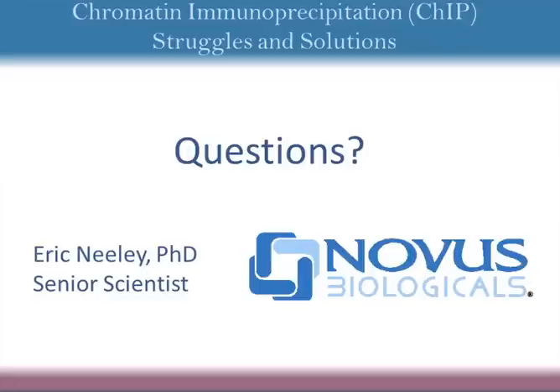So most companies will grade their antibody and call it ChIP grade or ChIP validated. You don't want to use this as a misnomer. You don't want to say that if it's not ChIP grade or ChIP validated, that it's not good for ChIP. It just means that the company hasn't had the time to validate that particular antibody for it.